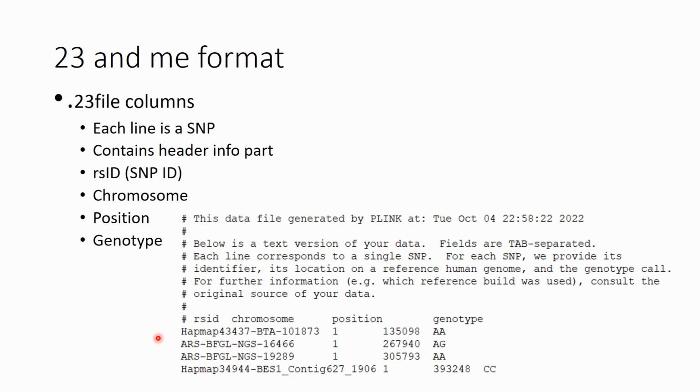In this case, I was also modifying the cattle data to trick the system a little bit. I can just show you some example here, but normally these would be human SNPs, because this would be a human data set. Anyway, these are the SNP names, chromosomes, positions, and the genotypes, which are shown here in this joint format, without a space between the alleles.